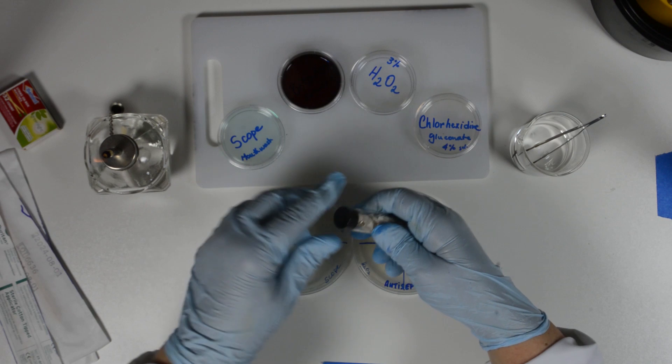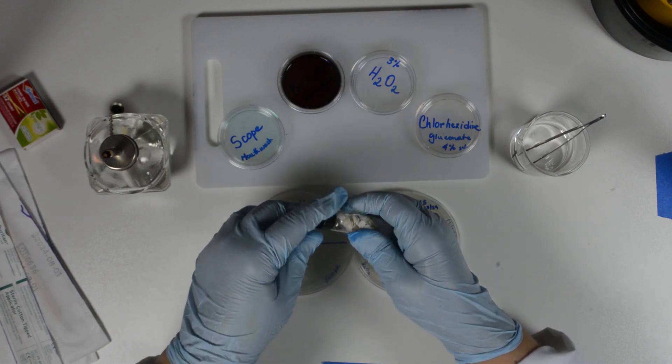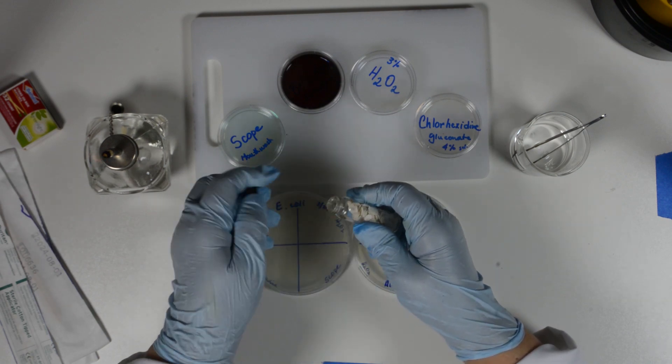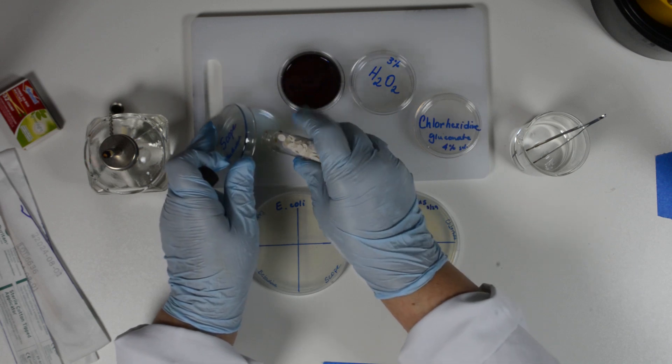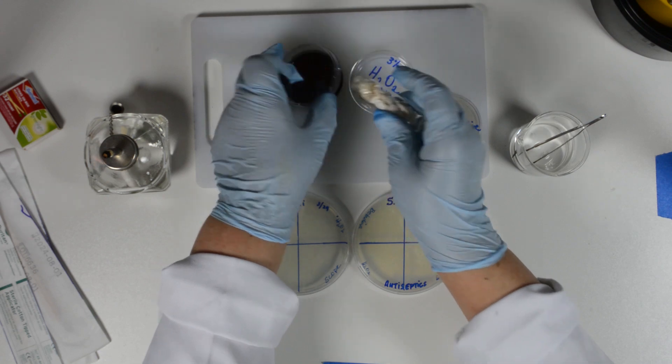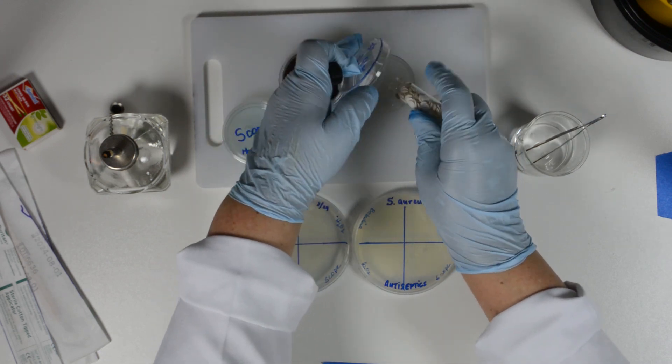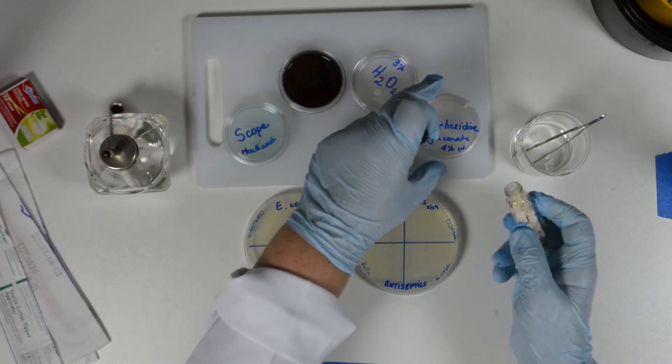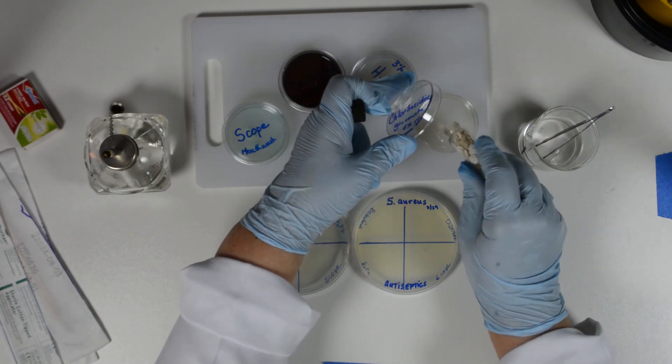We used sterile filter paper discs, 6mm, that we soaked with common household chemicals. Small amounts of each chemical were poured into 55mm diameter Petri dishes, labeled them, and a few blank sterilized discs were dropped into the chemicals.